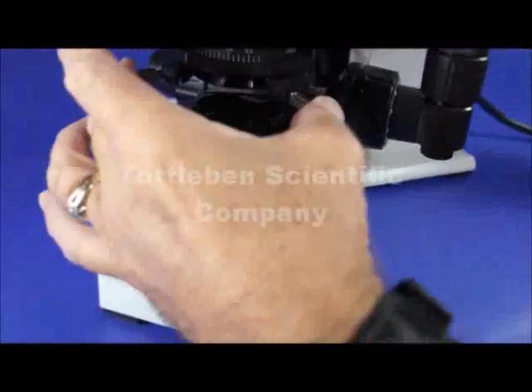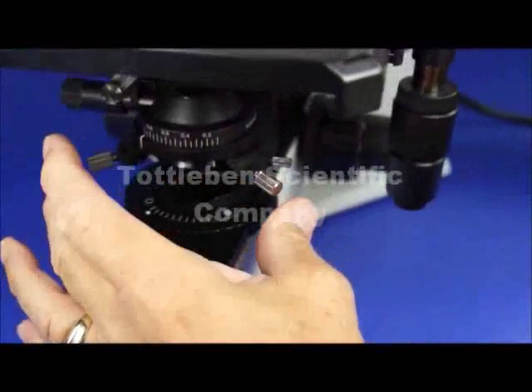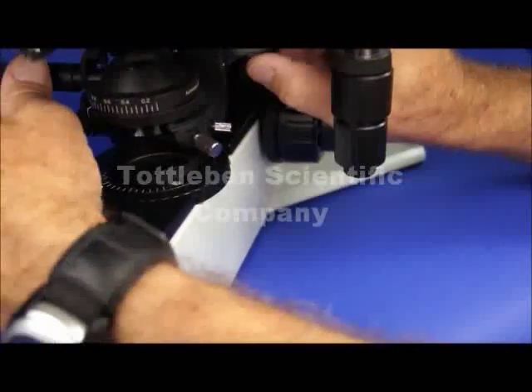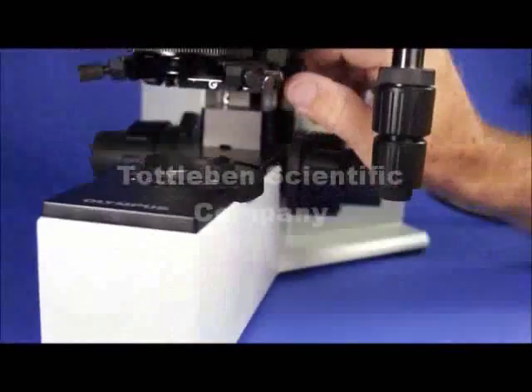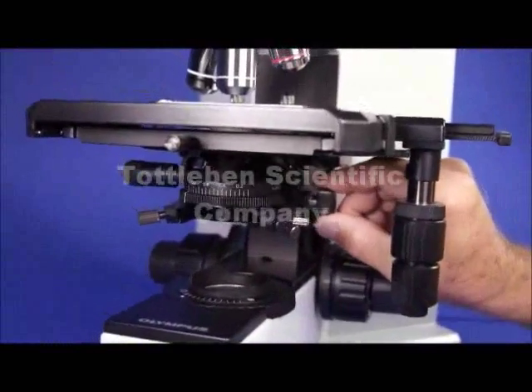We have a centering condenser. This microscope is Kohler illuminating — you can set it up for Kohler illumination. You can flip the lens back in, so whenever you go back to doing microscopy with your other lenses from 10x on up to 100x, you want to raise the condenser and flip that lens in.